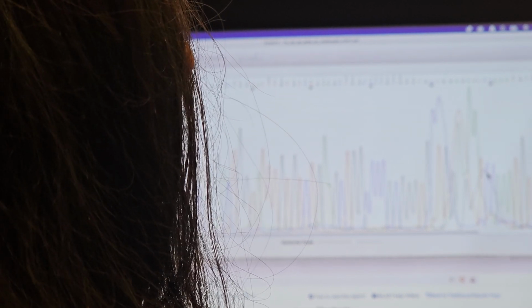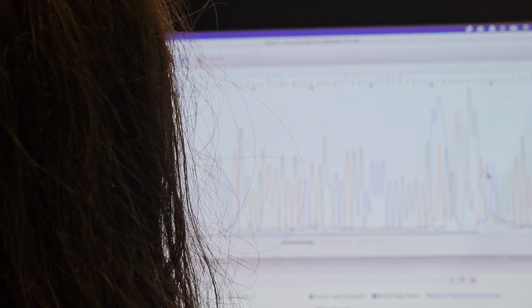See how there are these really high peaks and this blob here. That's where the dideoxynucleotides come out that are not attached. Remember, we put our sequence reaction through a Zymo column to get rid of the unincorporated dideoxynucleotides, but you can't get rid of them all, and so you always see this rough area here at about 80 to 90.